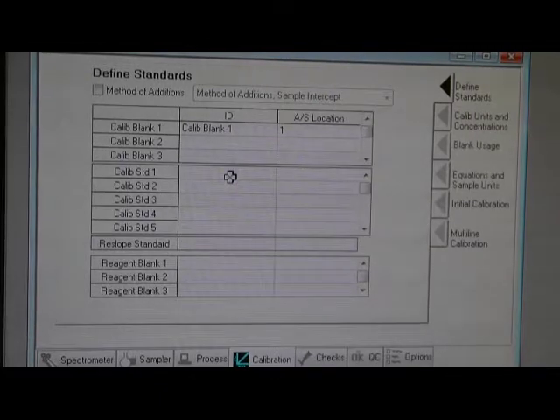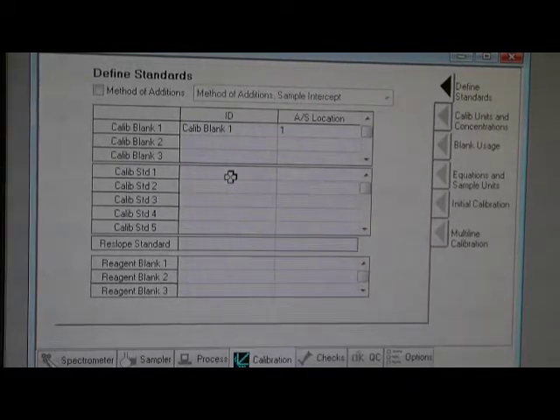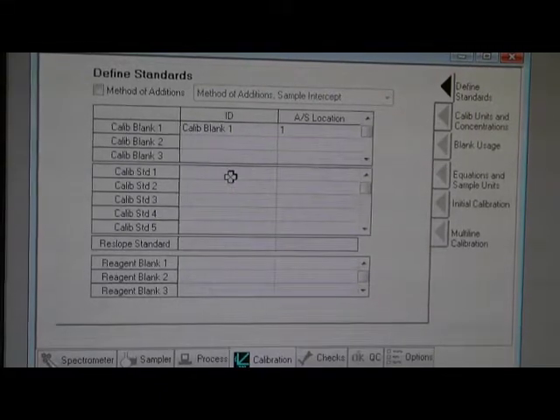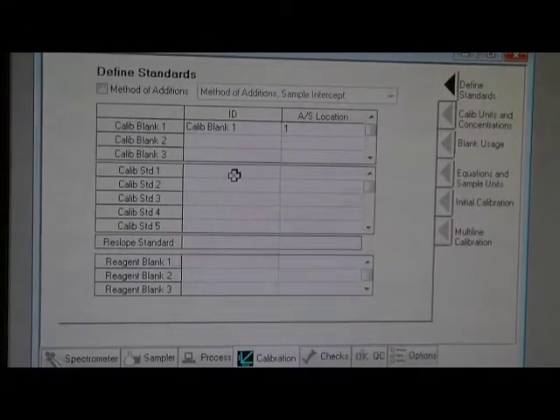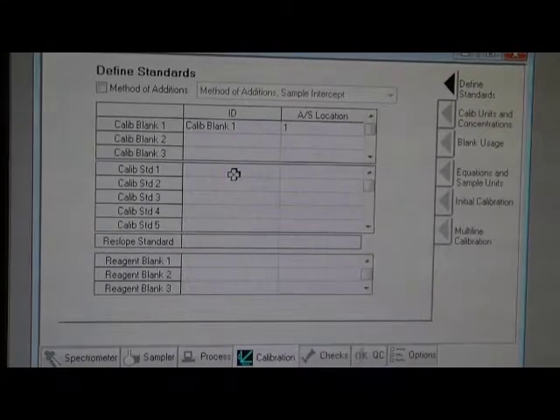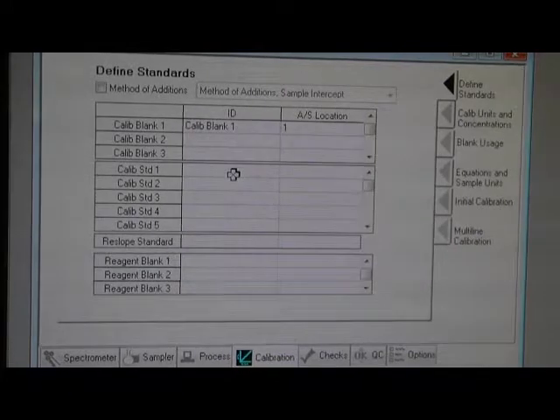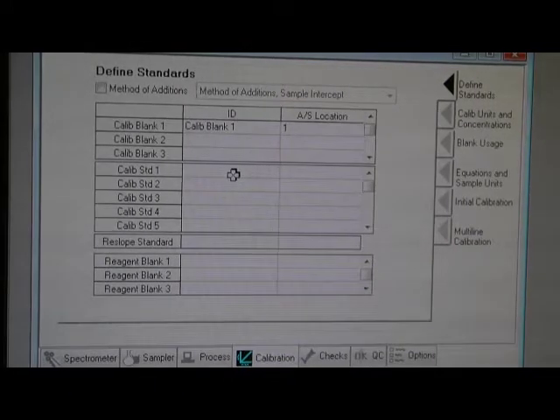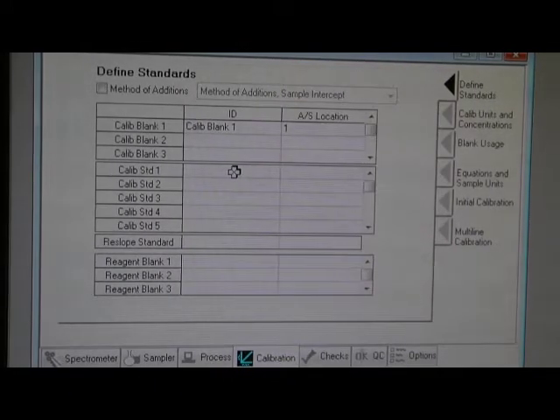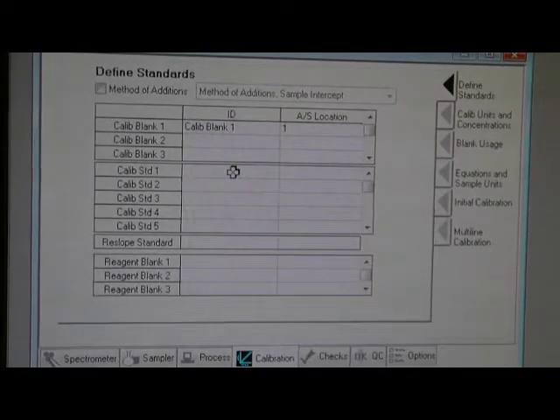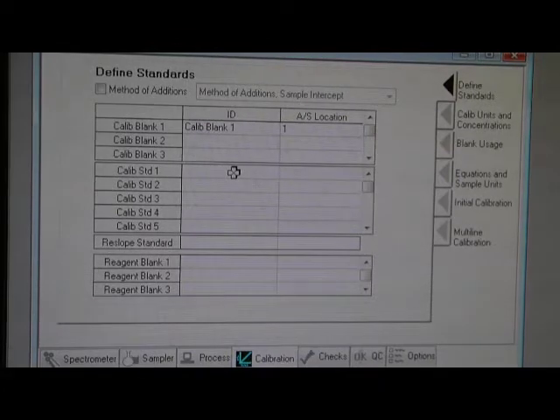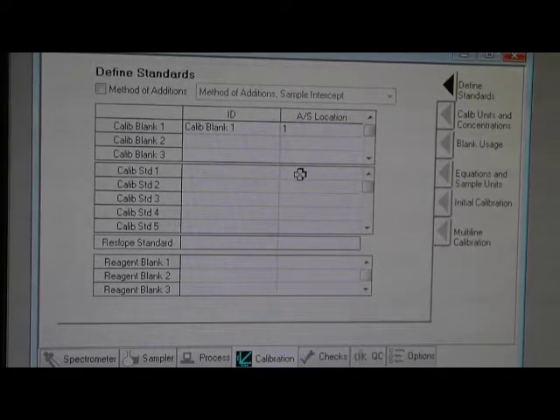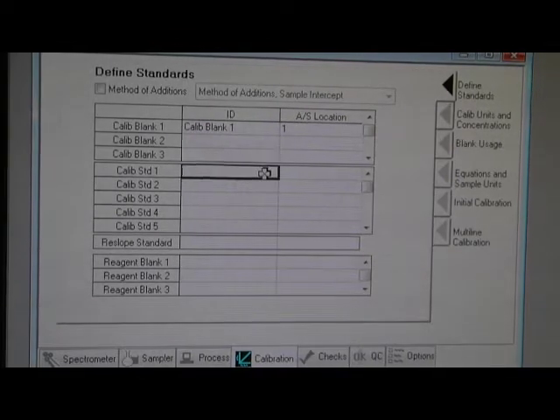And now you should choose how many standards you want to test. This one needs to follow your instruction. For today, I just put 3.